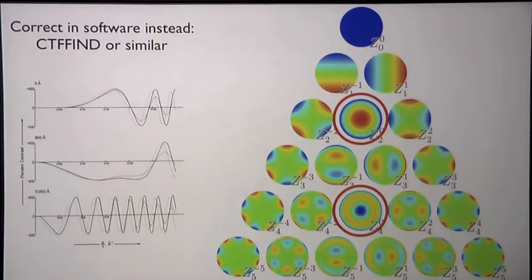Whereas defocus is exactly what we're trying to change with the current. And because of that, we can actually shift the phase of this relative to this and make a pseudo-phase plate, right? So this is actually what we're using to generate the contrast in these terms, the difference between these two aberration coefficients. Anyway, enough aberrations.